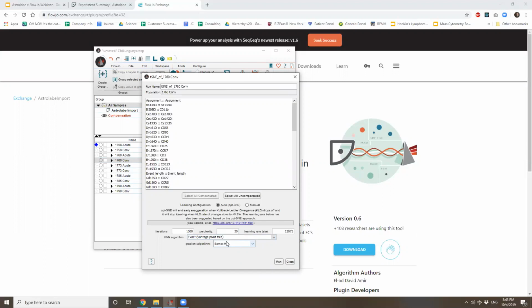We can start out by either calculating the distance between every pair of cells, which is extremely time intensive but will be exact, or we can actually steal an algorithm that Spotify is using to determine which music to play next for you, which is to make essentially the assumption that if there are two cells and there's a third cell that's a neighbor to both of them, then the neighbor of your neighbor is your neighbor. And if the other cell is not a neighbor of your neighbor, then it's not.